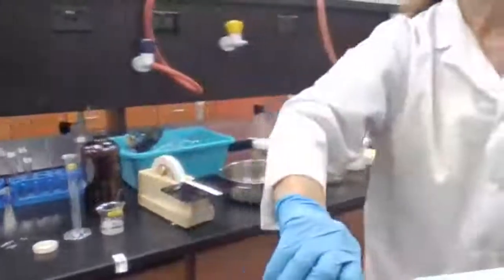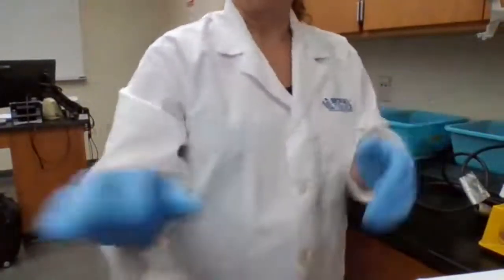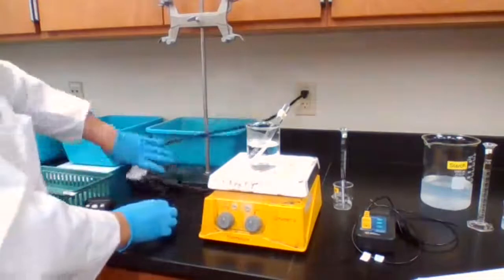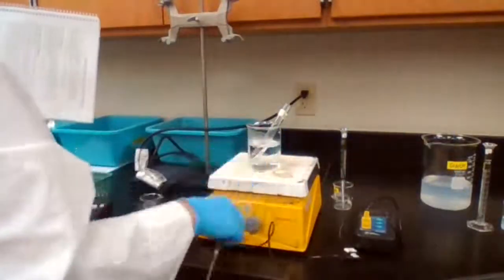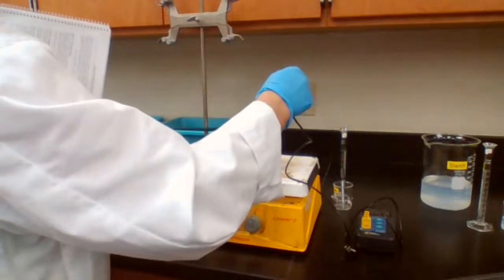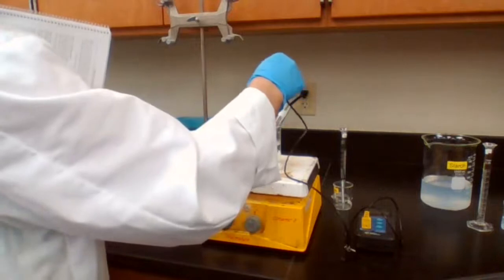Place the test tube in a hot water bath to increase the temperature. Let's see what temperature we have. It's supposed to be like 40 degrees.